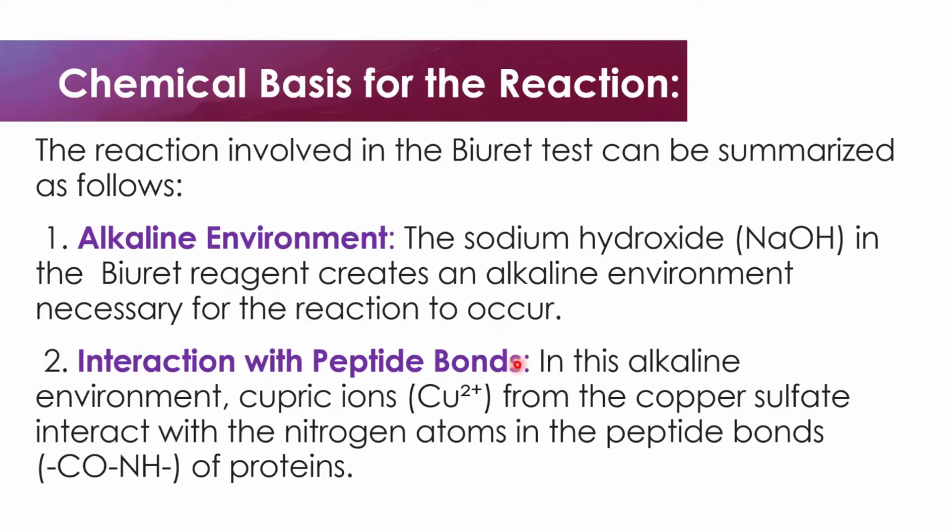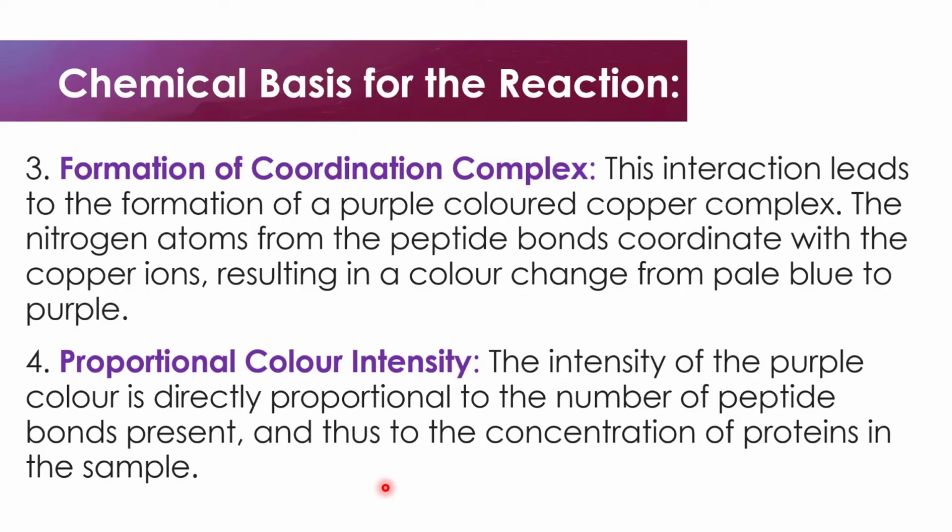In this alkaline environment, which is created by the sodium hydroxide, cupric ions from the copper sulfate interact with the nitrogen atoms of the peptide bonds of the protein. And this leads to the formation of a coordination complex. In this step, this interaction leads to the formation of a purple copper complex.